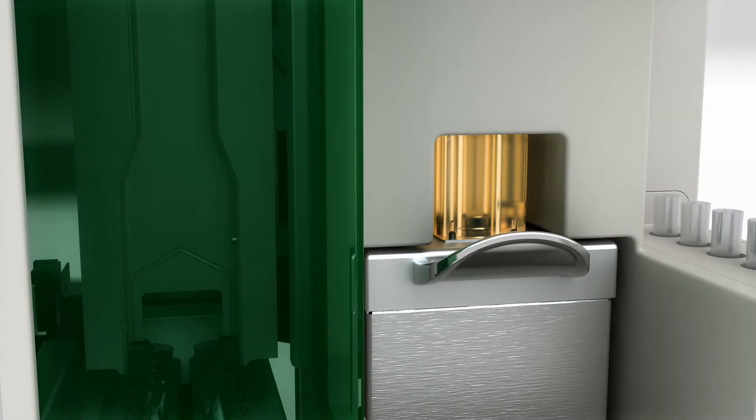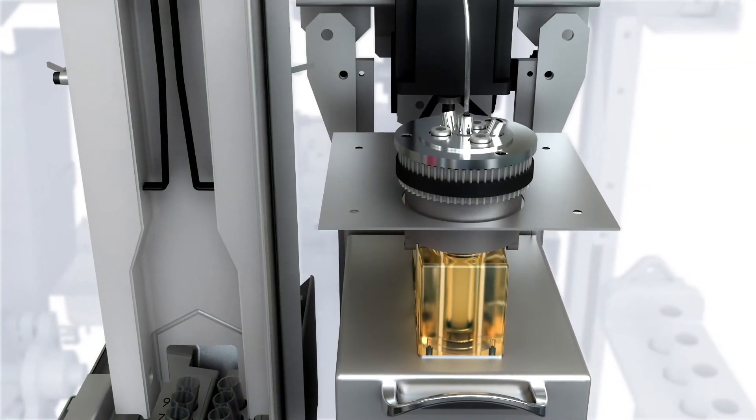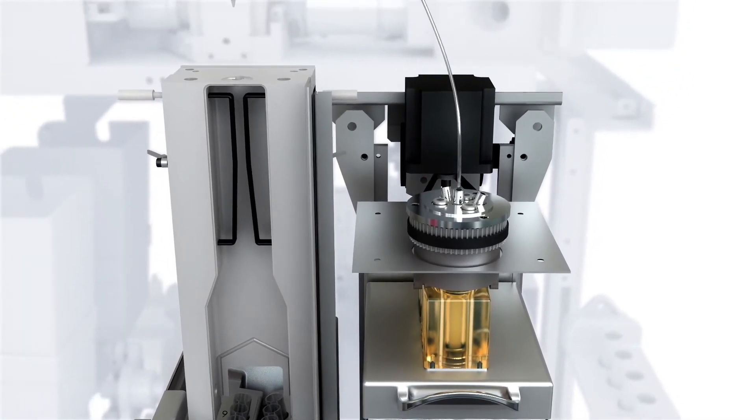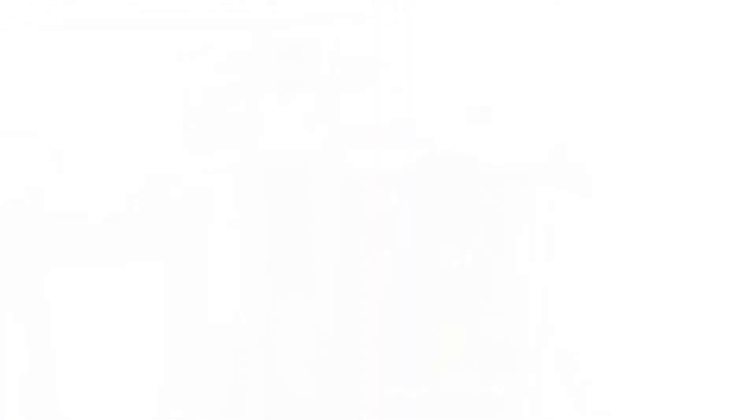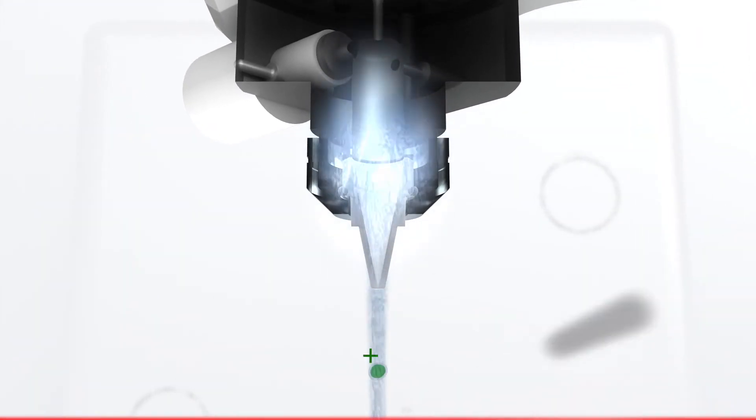You also never have to worry about your precious samples going to waste. An inline bubble detector tells the instrument to pause sorting when a sample tube is run dry. Using poor quality samples will affect your data from downstream genomic experiments.